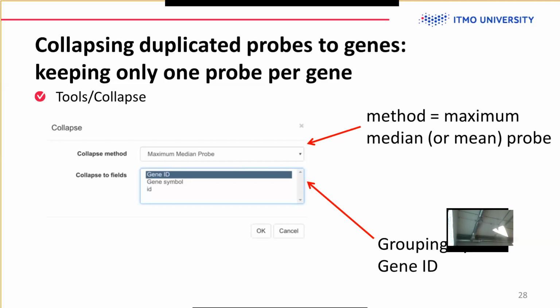For this, RNA sequencing data is a better approach, and there are particular methods to assign RNA sequencing reads to isoforms, and special methods that try to compare them. So isoforms are not the easiest way to look at and understand the data.